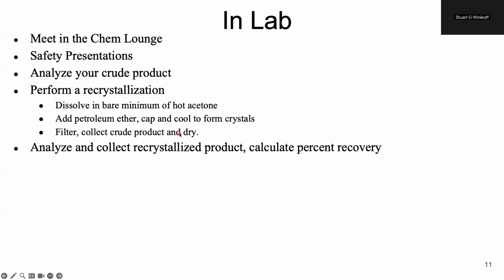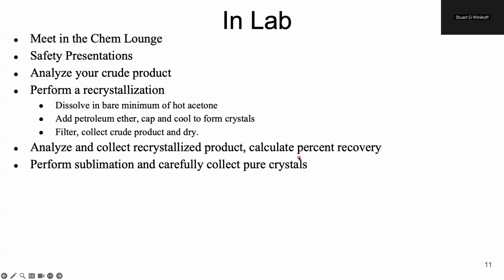All right. So while you're setting up the next part, you can go ahead and let your crystals dry before you take your crystallized product mass. And again, you can use this to calculate your percent recovery. Then you can go ahead and start your sublimation.